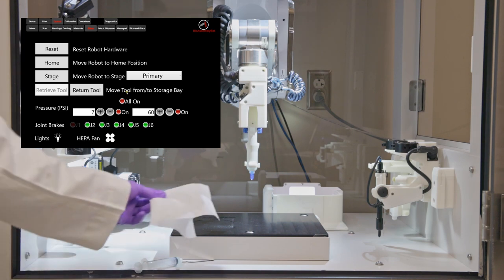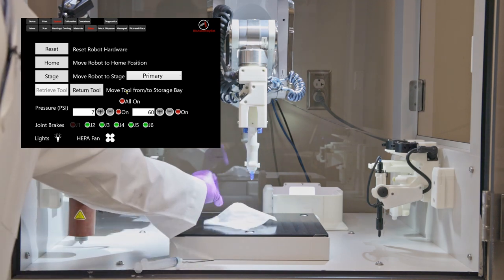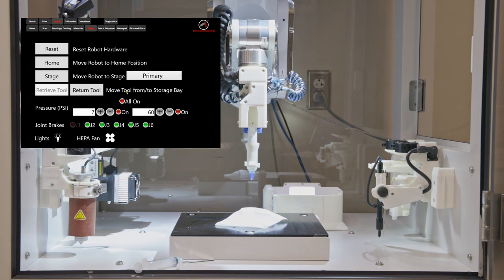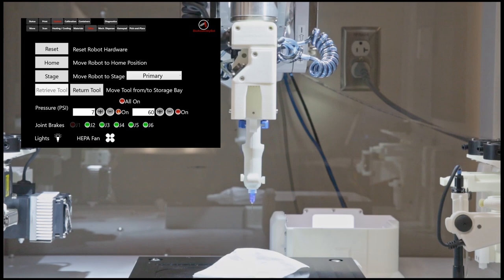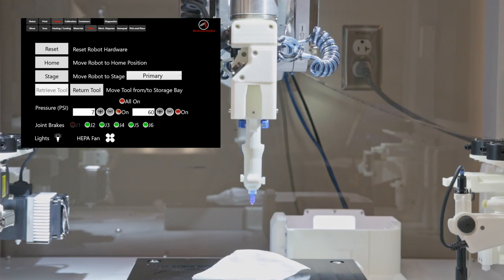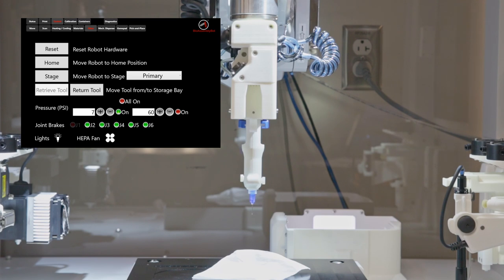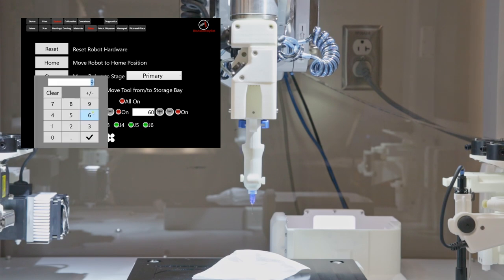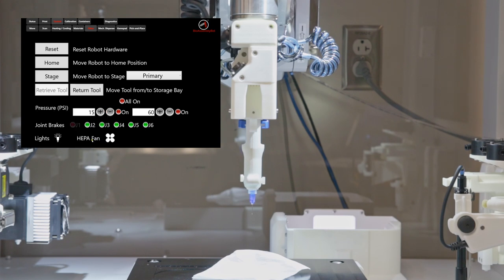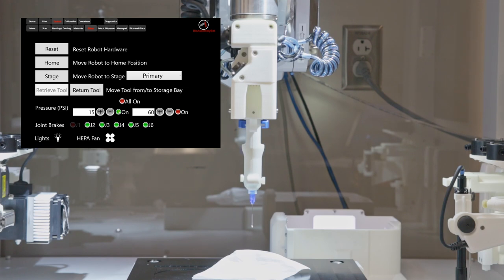Place a piece of kimwipe below the needle to collect extruded material. Click on to enable the pressure. Right now, the pressure is set to 7 psi. Click on, and now a pressure of 7 psi is applied on the ink. See if the pressure extrudes the ink or not. As this is not sufficient, we can increase the pressure by clicking the plus sign here, or clicking on the number and entering a value. Maybe we can try 15 psi. Click on again to apply the new pressure. See if the material is being extruded. As we can see, the material is being extruded uniformly at 15 psi.